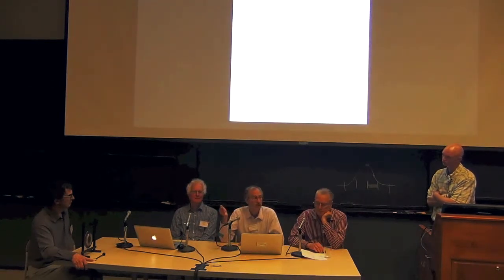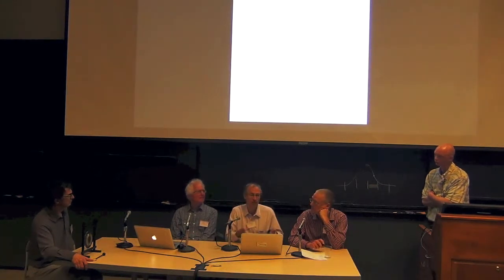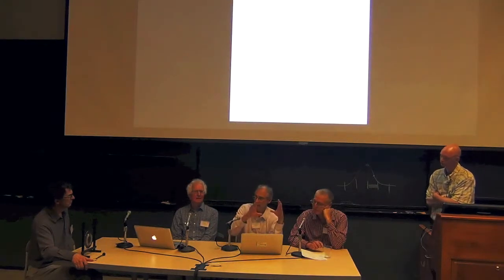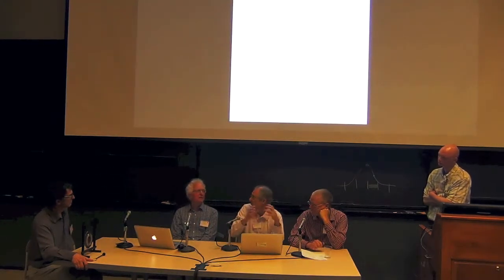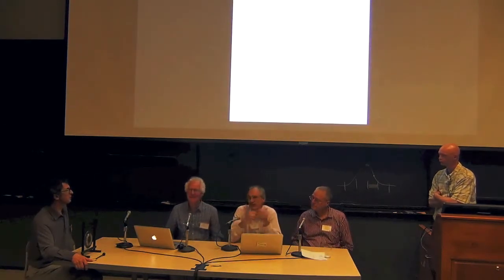The PDB folks, to my knowledge, make no distinction. They just assume that you've reported the correct I over sigma. There is not a field for average I divided by average sigma, and a separate field for the other. They don't define what they want. Well, they don't know, because we haven't told them what they want.